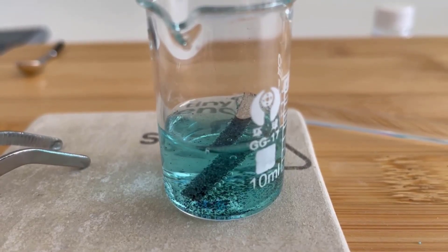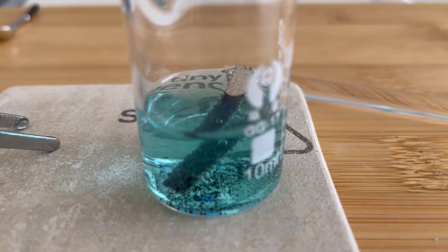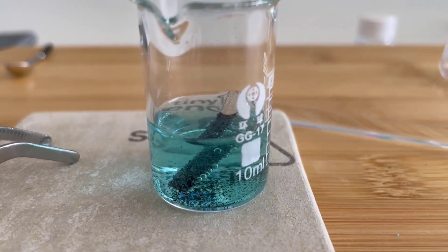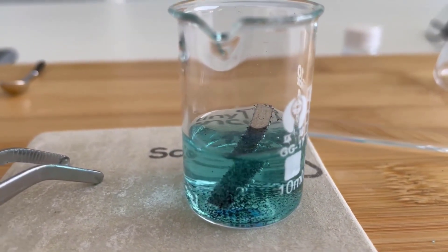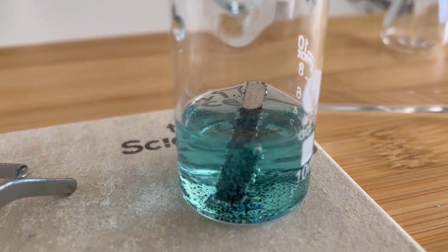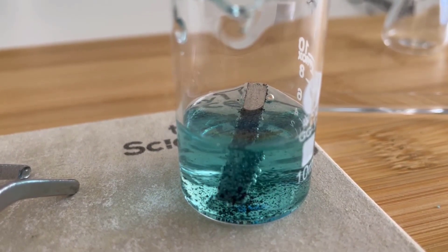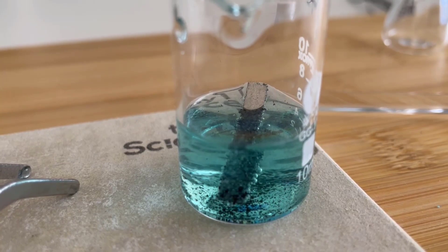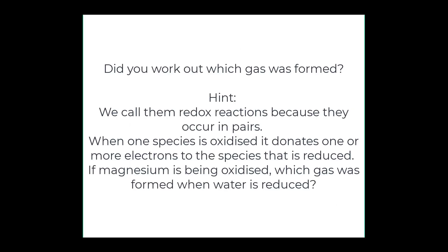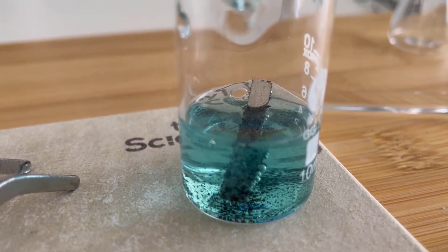You may also now see that some little flakes are starting to appear in this solution — we're getting a precipitate. So there is definitely a reaction occurring: there's a precipitate forming and there are also bubbles being produced. You can look at your table of standard reduction potentials and see if you can work out what's actually happening to the water in this case. Are the bubbles bubbles of hydrogen gas, or are they bubbles of oxygen gas? And how could we tell the difference?